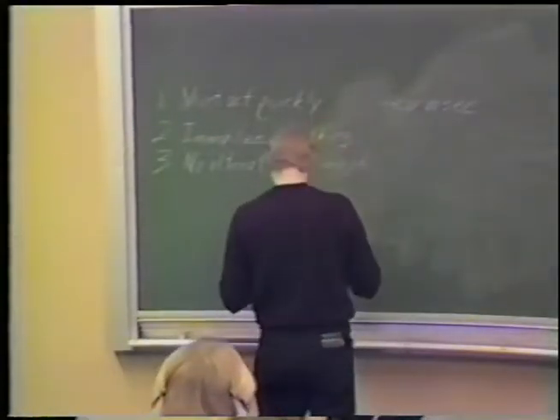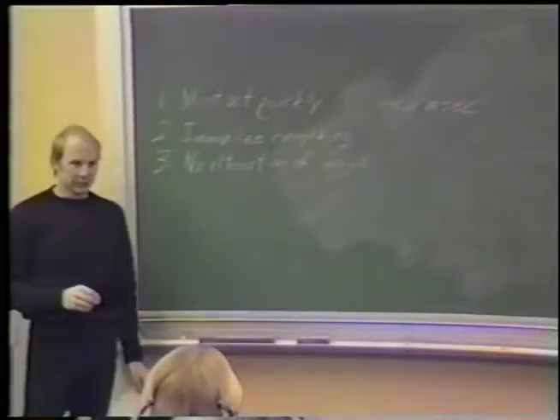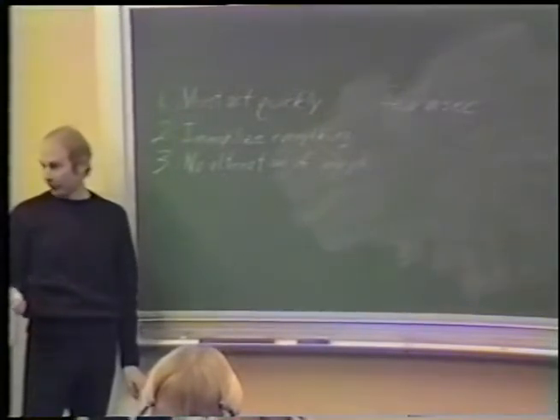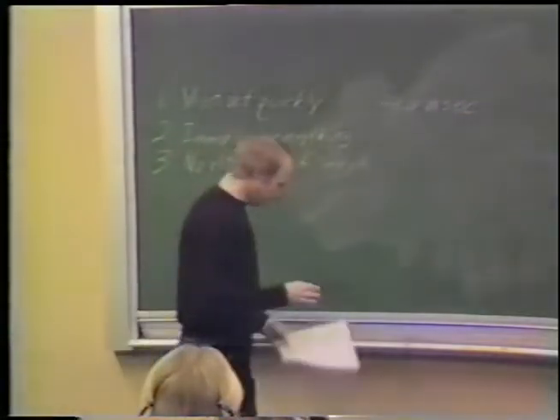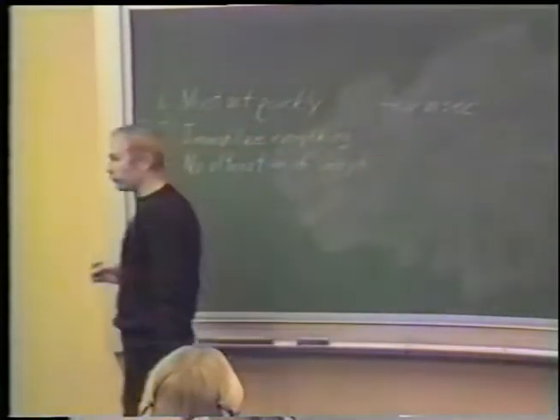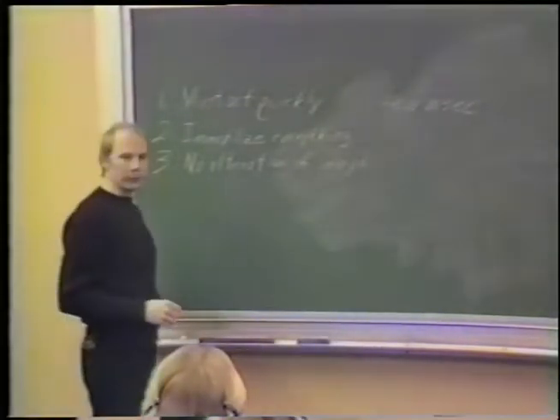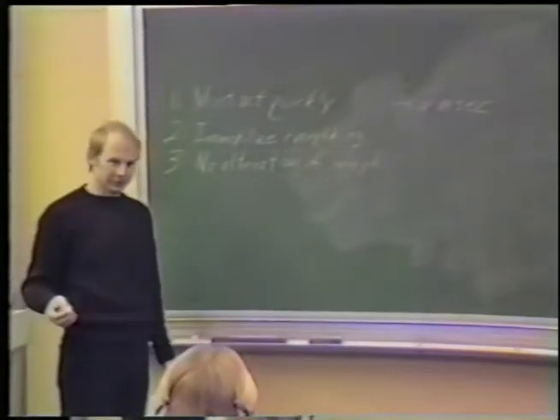Okay. Now, the fixative should immobilize everything. And as long as you stay below the temperature of recrystallization, ultra-rapid freezing again will do that. All translation is going to stop in that sample when it's ultra-rapidly frozen. Okay? There should be no alteration of the morphology. Well, there are 3 artifacts associated with ultra-rapid freezing. One, we just discussed, is ice crystal formation, in which case you haven't gotten ultra-rapid freezing. But that's easy to recognize.